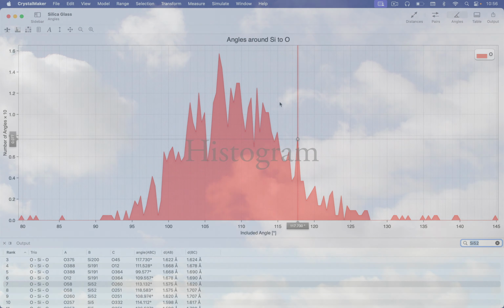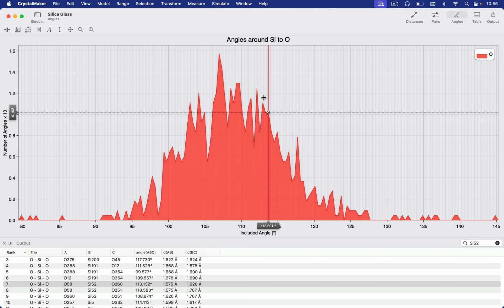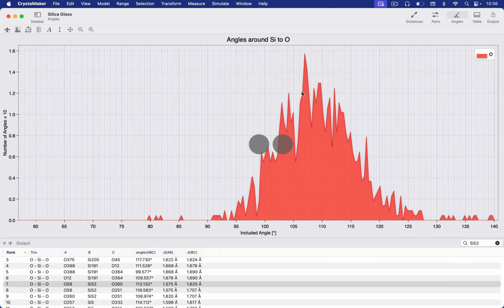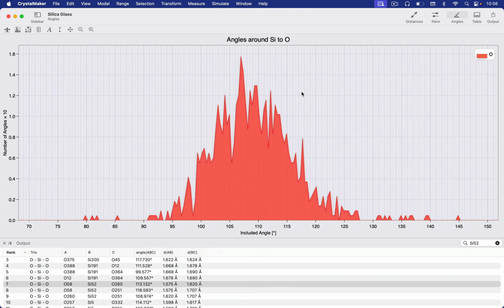Clicking on the histogram reveals this cursor, which you can click and drag to reveal some measurements. And we could use standard multi-touch gestures to zoom or scroll. I'm sliding 2 fingers across my trackpad to emulate a track wheel.